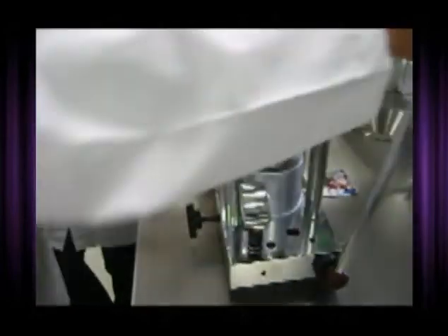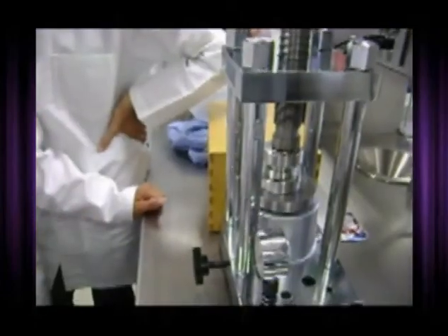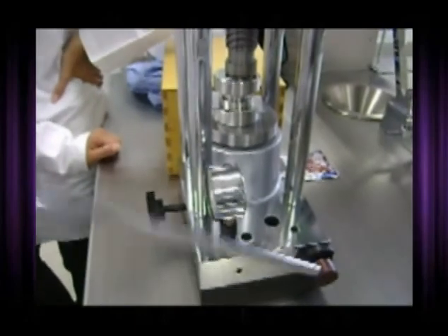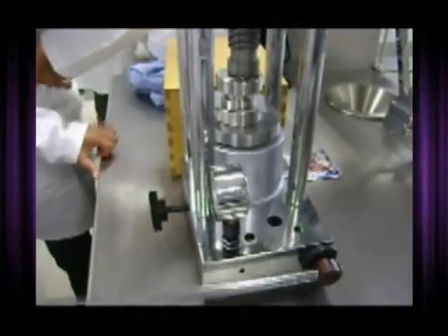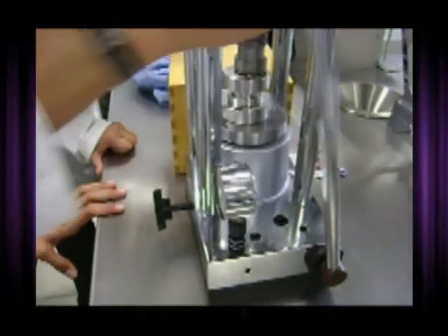How does the hydraulic press work? The pressure throughout a closed system is constant. One part of the system is a piston acting as a pump, with a modest mechanical force acting on a small cross-sectional area. The other part is a piston with a larger area, which generates a correspondingly large mechanical force.